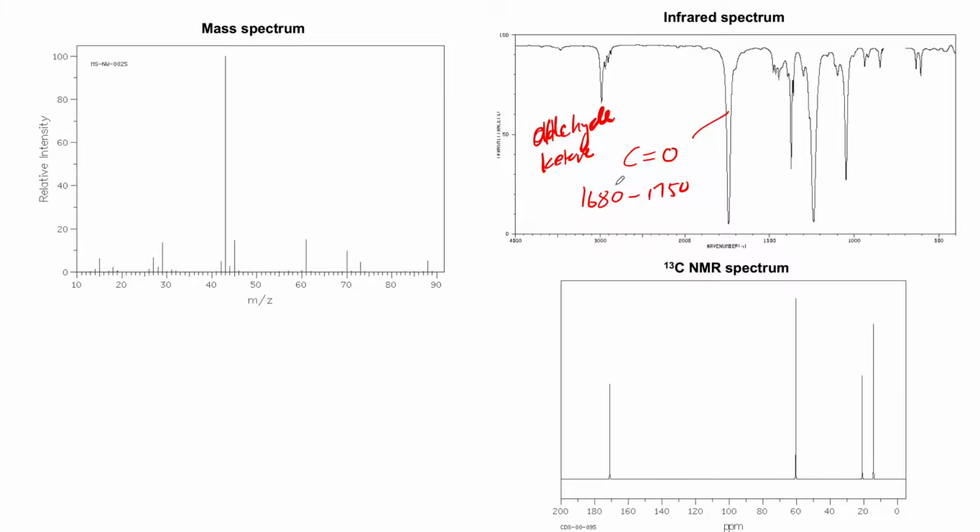However, those two functional groups are not consistent with this infrared spectrum, because a carboxylic acid would also have an oxygen-hydrogen absorption on the far left-hand side of the spectrum, which we do not see in the spectrum. An amide will also provide an absorption signal in the wave number range above 3000. Again, we don't see that in the spectrum. The other functional group that could be plausible is an ester. An ester also has a carbonyl bond as well as a carbon to oxygen bond, which is around the right-hand side region of the spectrum.